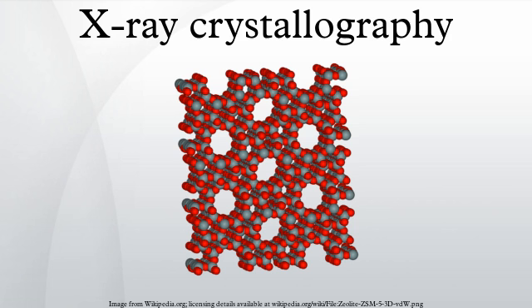The capillary or loop is mounted on a goniometer, which allows it to be positioned accurately within the X-ray beam and rotated. Since both the crystal and the beam are often very small, the crystal must be centered within the beam to within 25 micrometers accuracy, which is aided by a camera focused on the crystal.